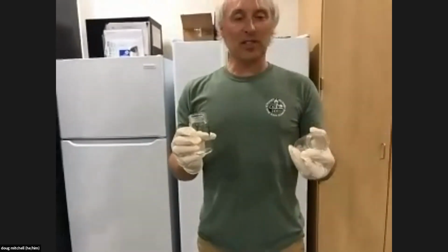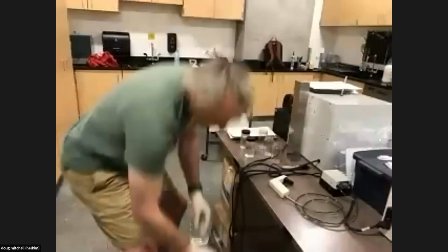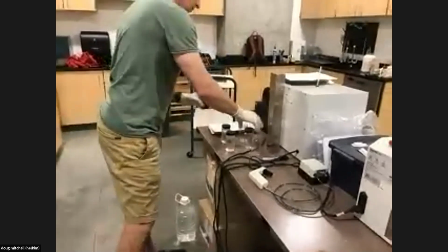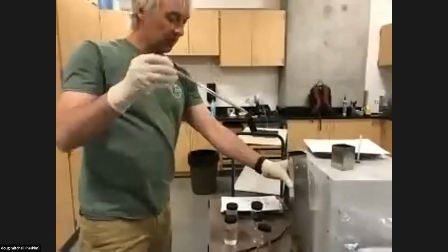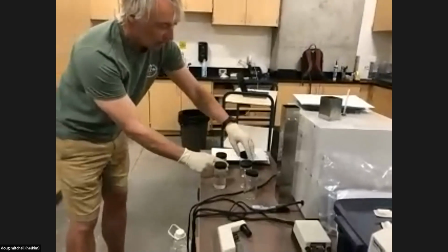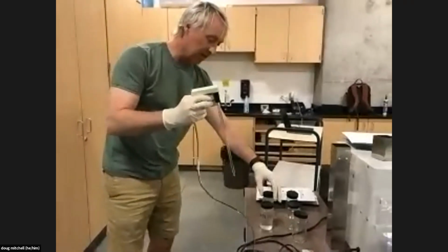Sorry, which makes it possible to do the glass containers rather than plastic. So that's super helpful. All right, so I'll get my containers set up. The first step is taking 10 milliliters of the sample water and putting it into a jar. So we have a nice little vacuum action pipette system here.